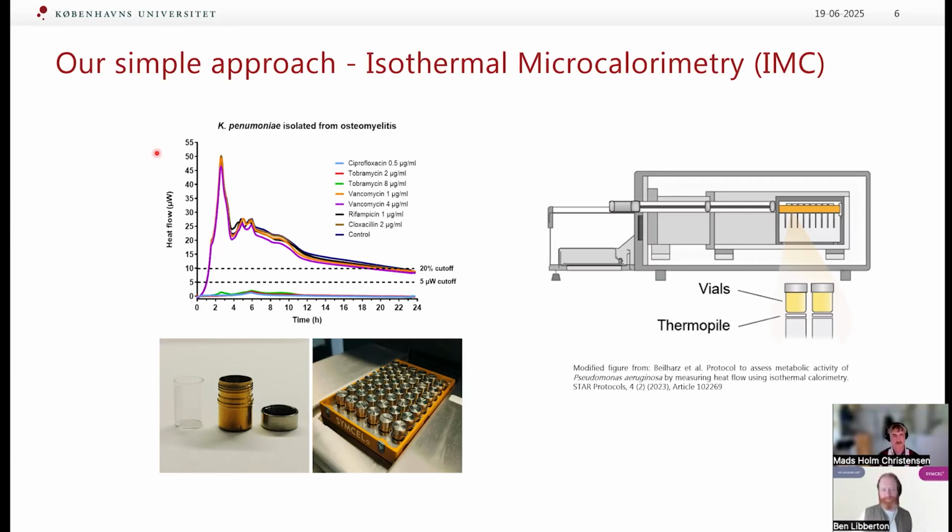Yeah, I have not experimented with that. The one I showed you, I have just streamlined the data, so I'm sure I'm looking at the same time frame for all isolates, and that was 24 hours, where I've just been using all of the data, so it accounts for all of the features. But definitely you could go lower. You don't have to look at the 24 hours, and especially if you have a lot more data than what I had available when doing this, you could go even lower, I'm sure, to cover all potential variants that could arise between these isolates.